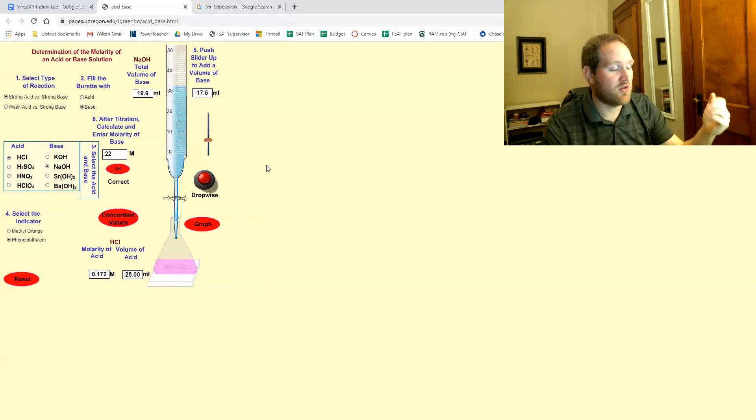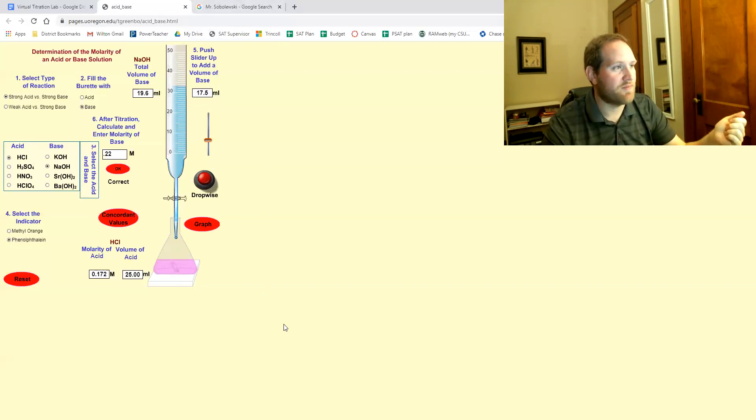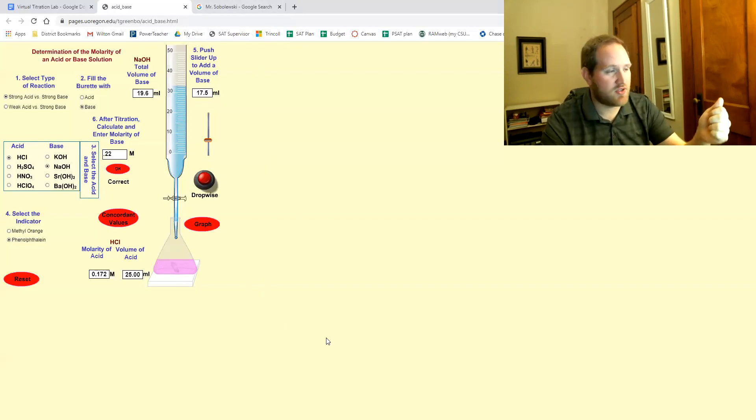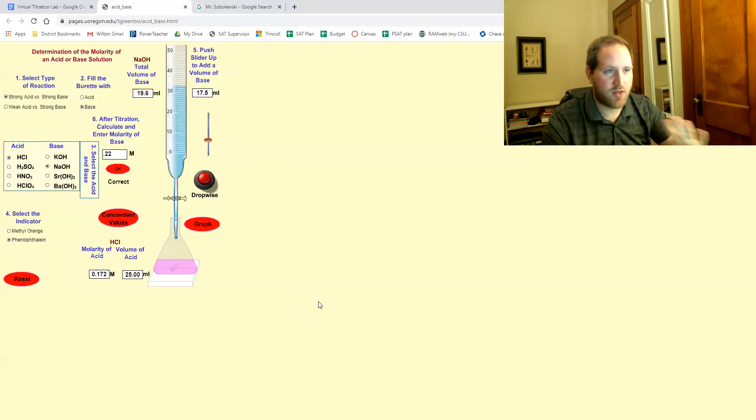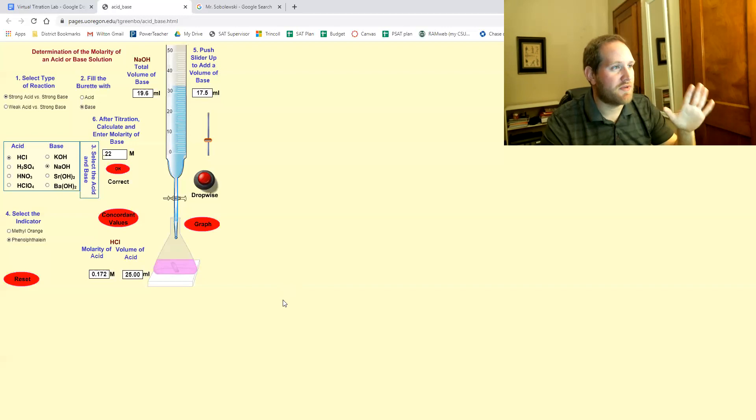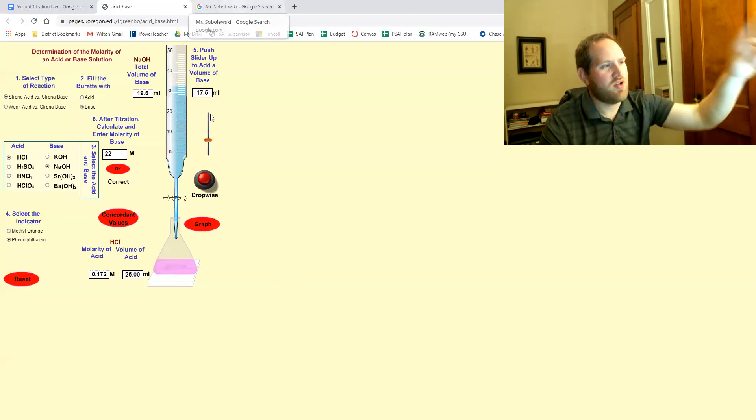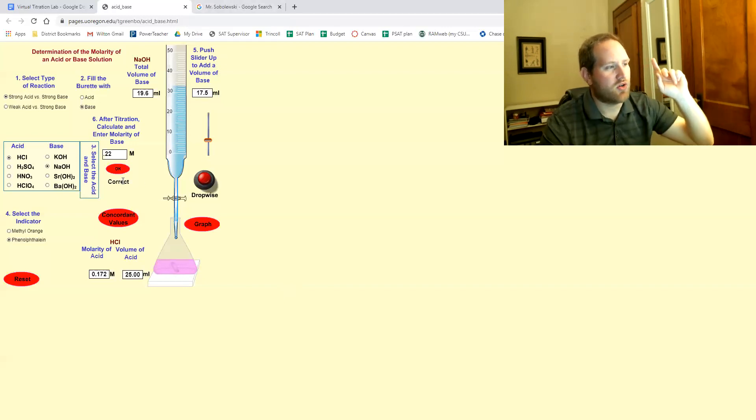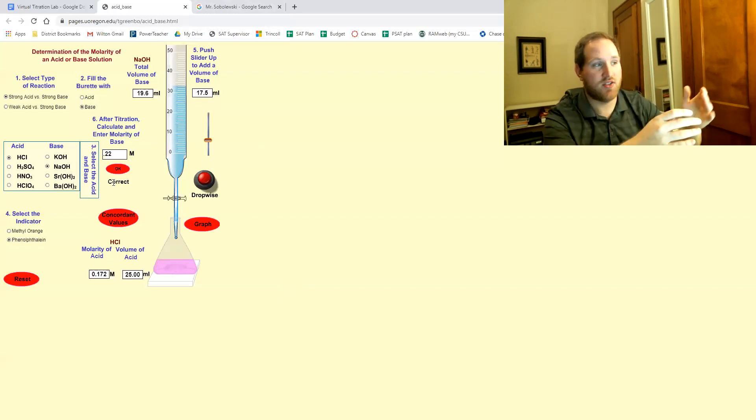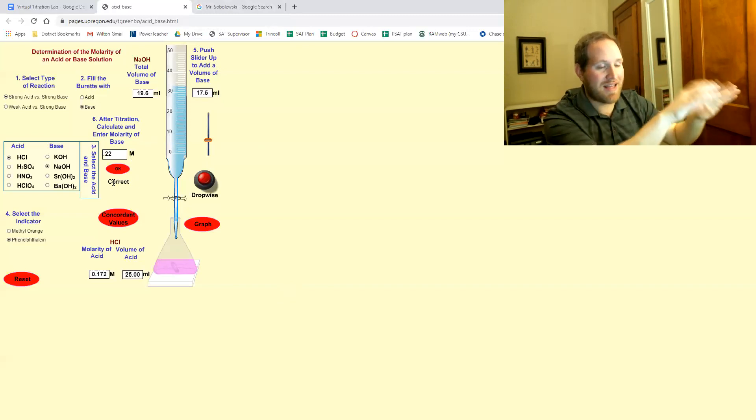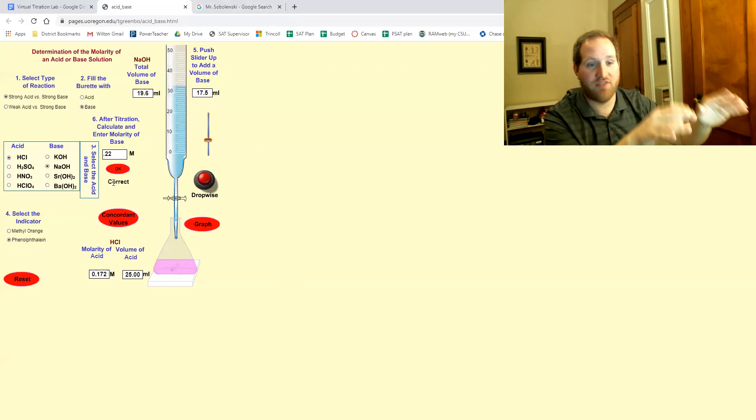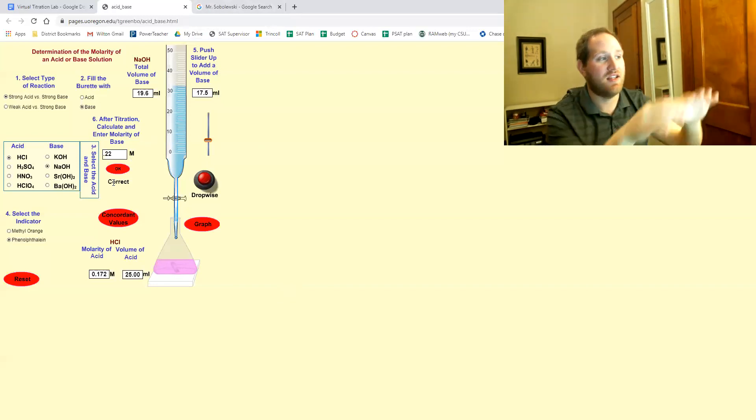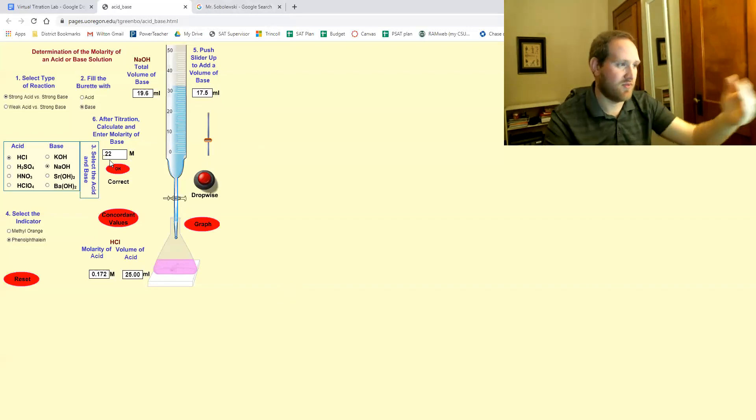So your screenshot, you can either take a picture with your cell phone or do a print screen thing, but you need to show three things: your tab, your correct answer showing up as correct, because it'd be way too much work for us to actually mathematically calculate everyone's three trials and check your answer. The program does it for you.